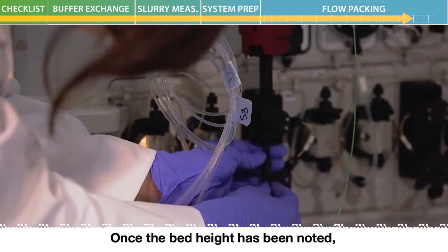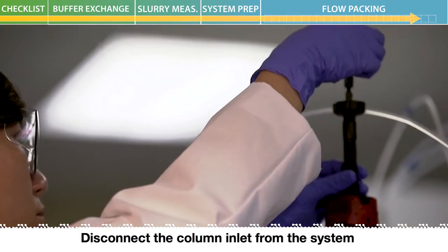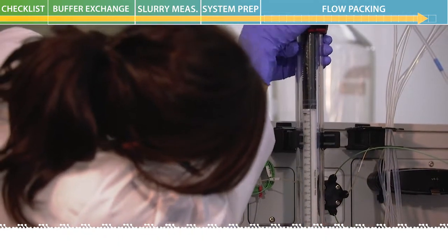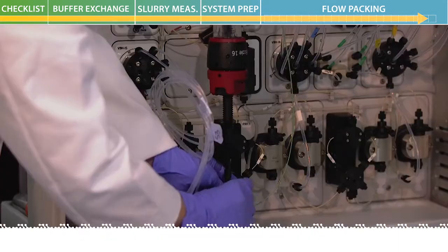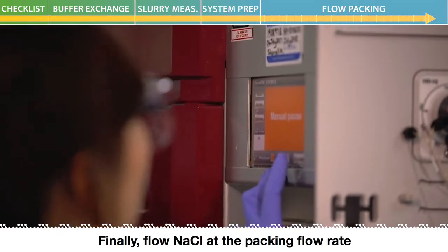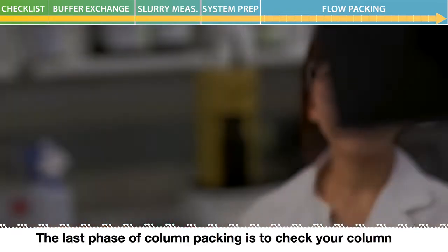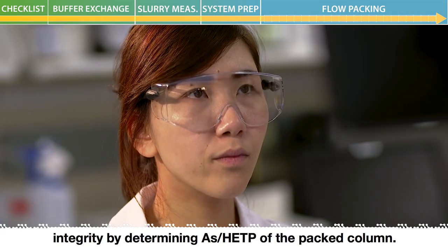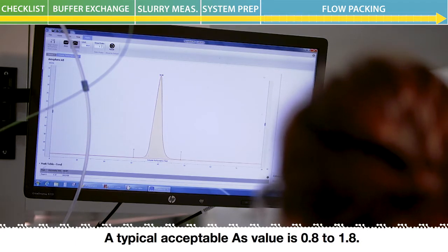Once the bed height has been noted, disconnect the column outlet from the ACTA and install a stop plug. Disconnect the column inlet from the system and lower the top adapter to the marked bed height. Now reconnect the column to the ACTA system. Finally, flow sodium chloride at the packing flow rate for 2 to 5 column volumes for conditioning. The last phase of column packing is to check your column integrity by determining asymmetry and HETP of the packed column. A typical acceptable asymmetry value is 0.8 to 1.8.